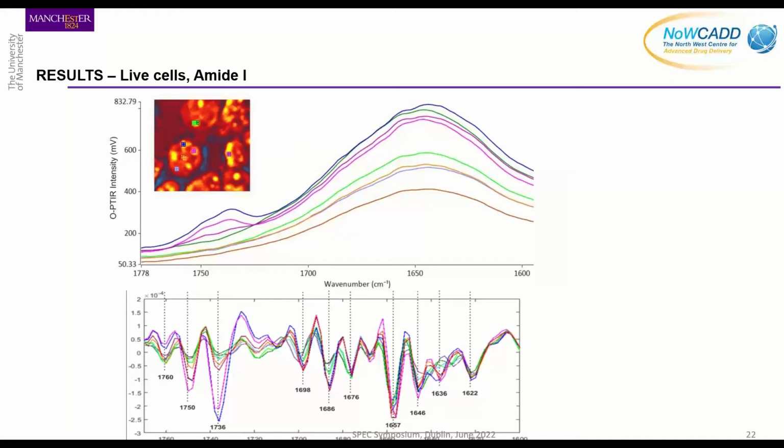And the changes that we can see, depending on where we are in the cell, are completely consistent in the amide-1 and looking at the carbonyl region, completely consistent with what we saw in the fixed cells. So to be able to do this in water was a major breakthrough for us, and certainly showed that this is the technique that we need.